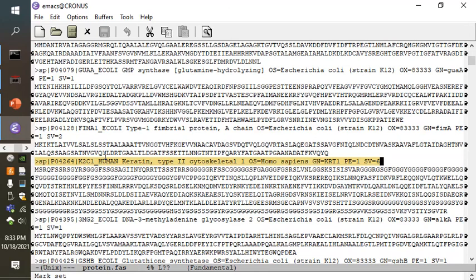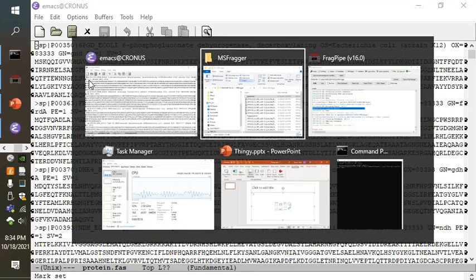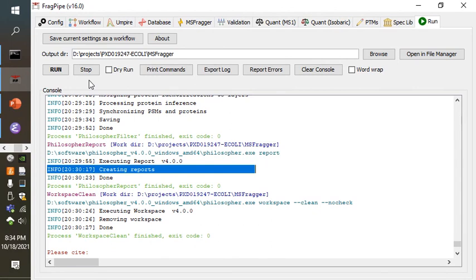We can do some other operations like ask how many times a greater than symbol appears in this file to give us a count of how many protein sequences are here. I believe that's feasible, but I'm not going to look it up at the moment. All right, but here we see that just in the course of this video, we've been able to do all of this data processing, starting from 6 raw files and a sequence database downloaded from UniProt to a subset database that we can now use on our top-down proteome.